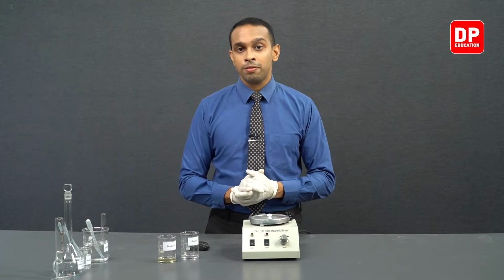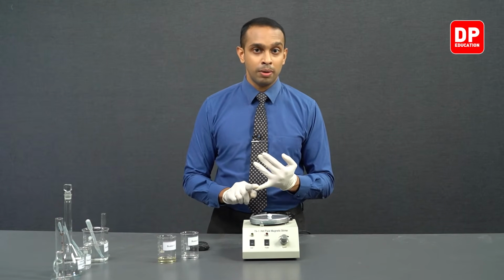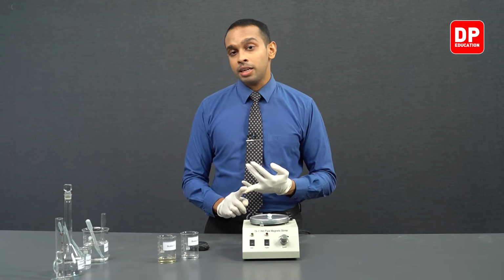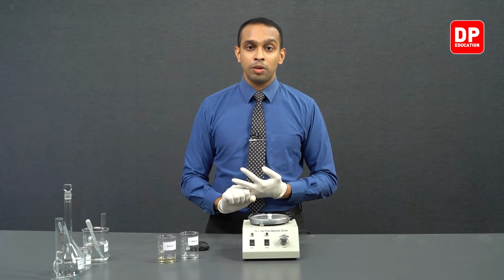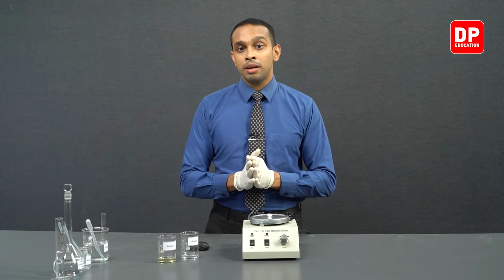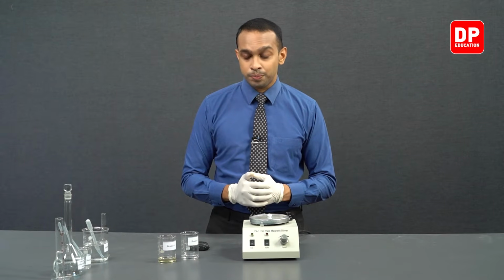So throughout these 5 reactions, we will not change the volume of potassium iodide that we take into the reaction mixture, and we will only be changing the volume of Fe3+ ion solution we will be taking into the reaction mixture. To keep the reaction mixture at a constant volume, we will be adding varying volumes of water.